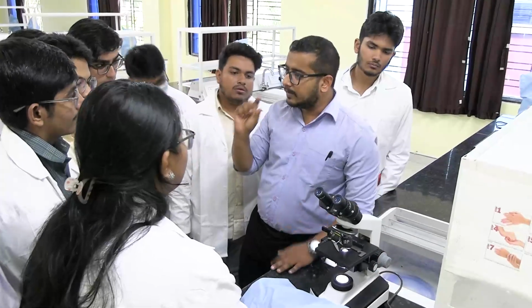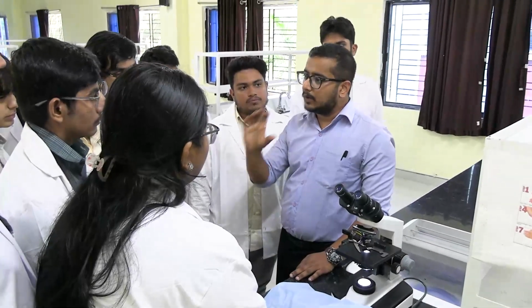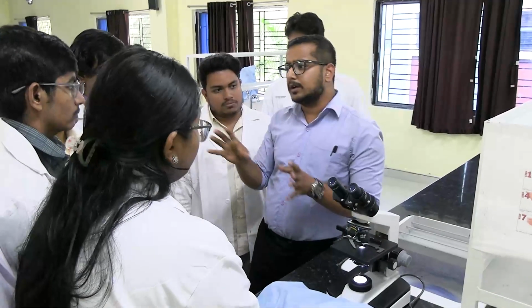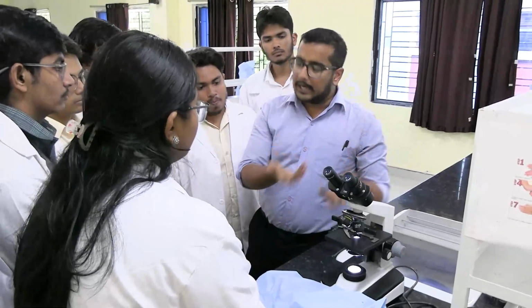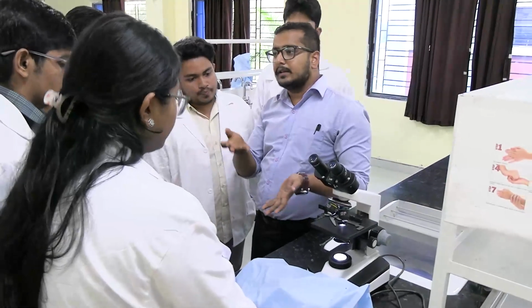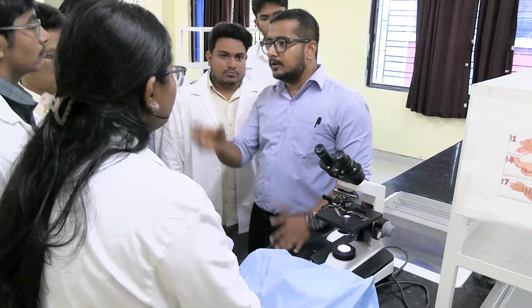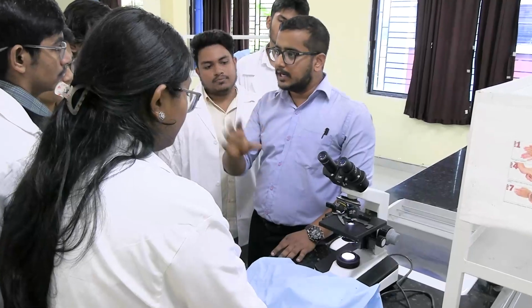These parts we have to remember, because these questions will be asked. At what position you have to keep it, you have to demonstrate it. The external is going to come, you have to demonstrate it. Then we'll place the slide, or otherwise the slide is already nearby. If you want to see the blood corpuscles and everything, it will be already focused. We'll be focusing starting from 5x, 10x, 45x and 100x.